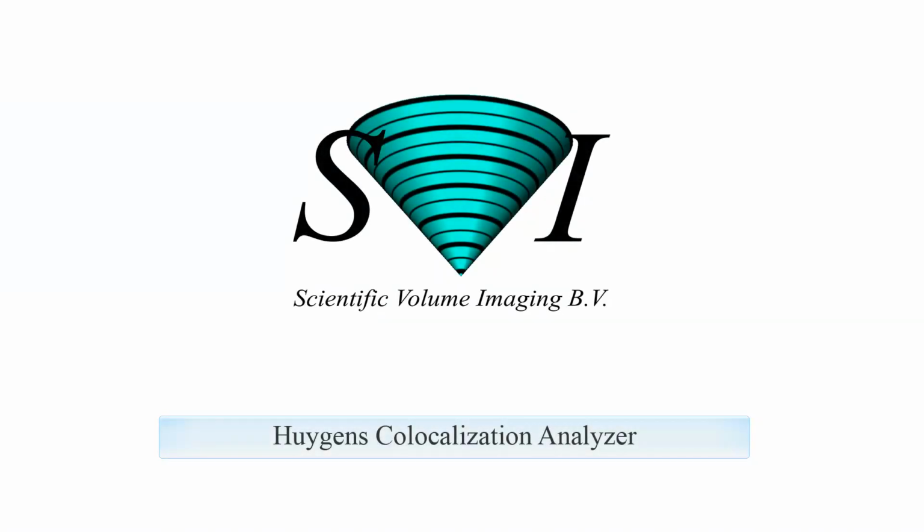Welcome to this tutorial on the Colocalization Analyzer in Huygens. This option is available for Huygens Essential and Professional. And in the Huygens Core, it is tailored toward high-throughput analysis.